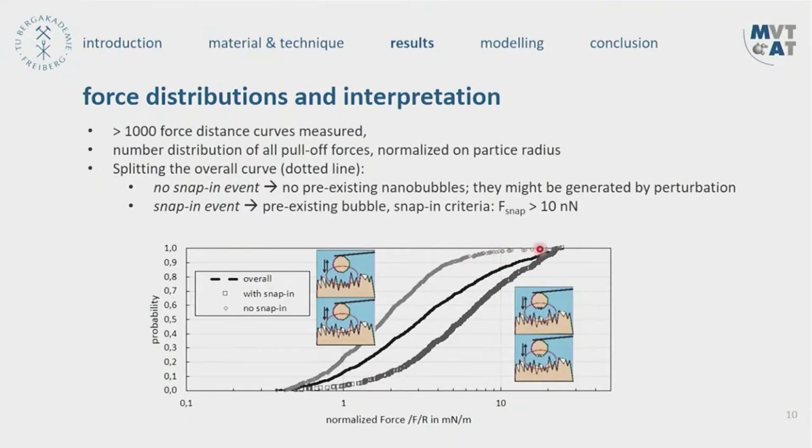And we ask ourselves, are nanobubbles available with every contact or not? And as we have seen on the distribution of nanobubbles on the surface, there might also be parts where there are no nanobubbles. So we think we do not have the capillary interaction, which is documented here, in all contacts, and we can distinguish between 2 adhesion mechanisms in the hydrophobic systems.